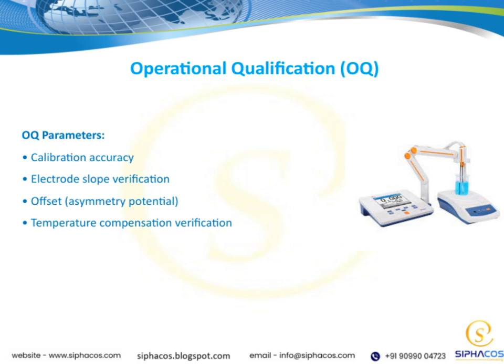Lastly, temperature compensation verification is vital because temperature can influence our readings. By confirming that our temperature adjustments are working properly, we ensure our results remain accurate regardless of environmental changes.